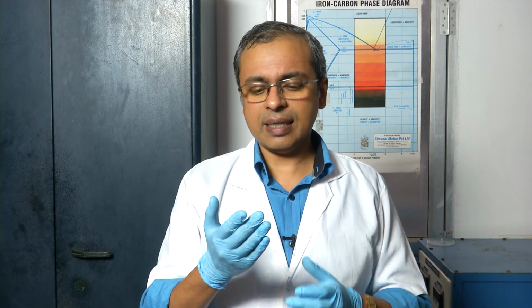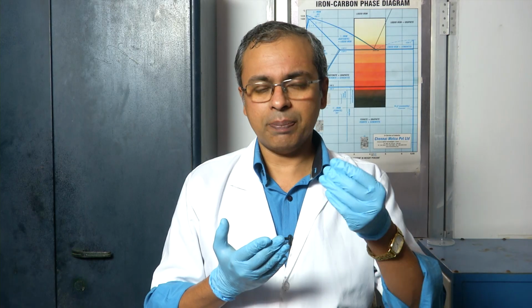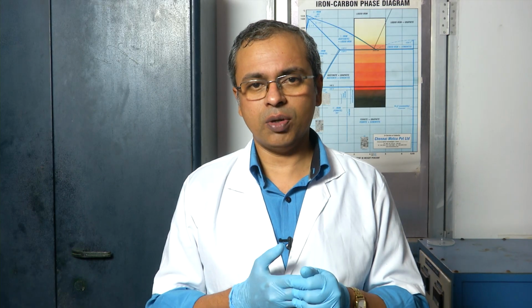So, they do not get in the way of your experiment, but they provide you with a lot of protection. Maybe the only thing you have to be concerned about when you wear a pair of gloves is that some of them may or may not handle a particular solvent or a particular form of liquid. So, you should be aware of what is the capability of the glove and then use it accordingly.